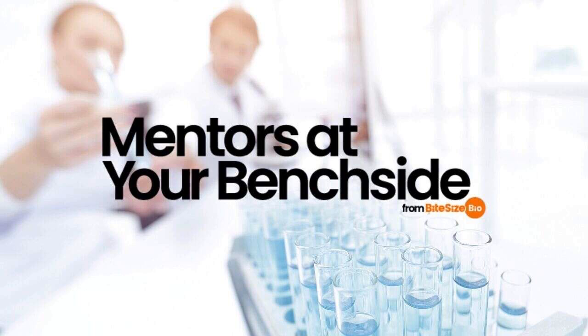This light then passes through a semi-transparent mirror that reflects it away from the laser and towards the detection system. The first object in this detection system is the pinhole aperture, which is in the intermediate image plane of the microscope. This allows only a small central portion of the light through to the light detectors. If this light originates from sample fluorescence, it will be a different colour from the laser light, and emission filters are used to separate it from the laser light that has been reflected from your sample.